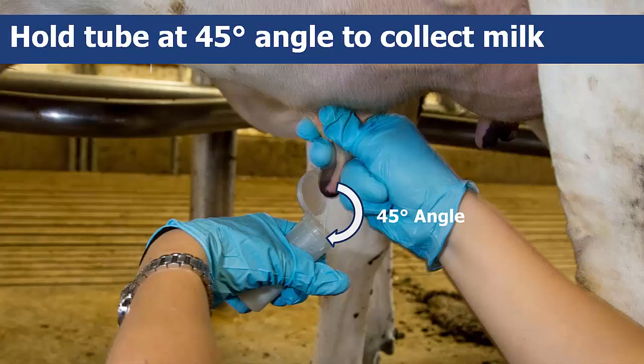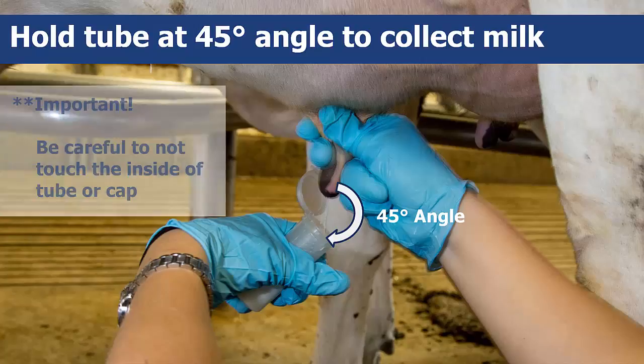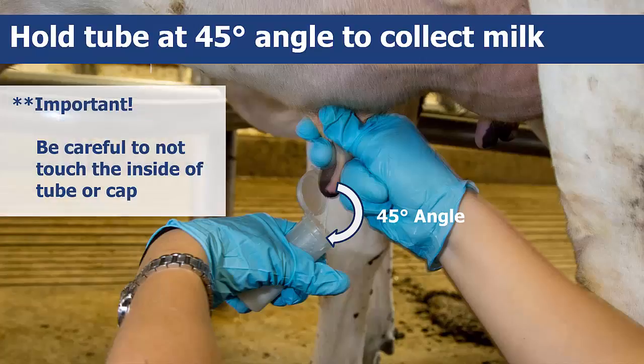Collect 3 to 5 milliliters of milk from the infected quarter of the cow in the properly labeled tube. Don't touch the tube lip with your fingers or the teat end. Recap the tube tightly. Repeat this step as needed with new labeled tubes if other quarters are infected in the same cow.